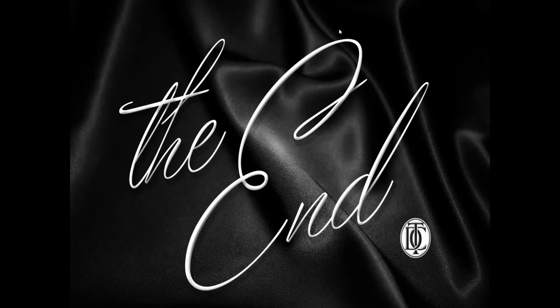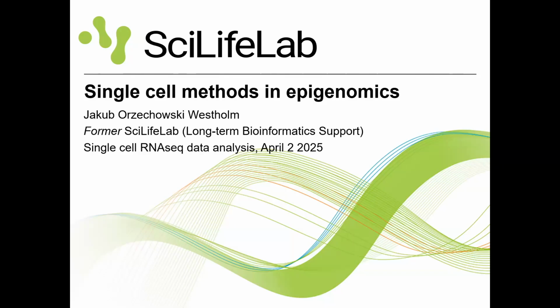Thank you for the presentation. I have a question regarding the peak calling of ATAC-seq. Is it like region on, region off, or does it take all the cells and then bin through the genome and look for these cells, there are reads here, and then stack it and then call a peak?